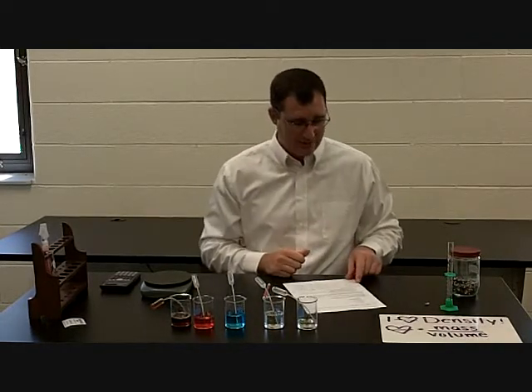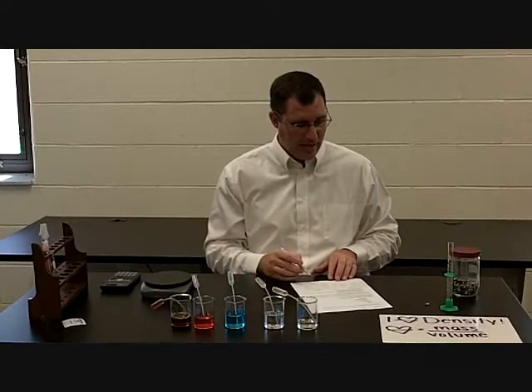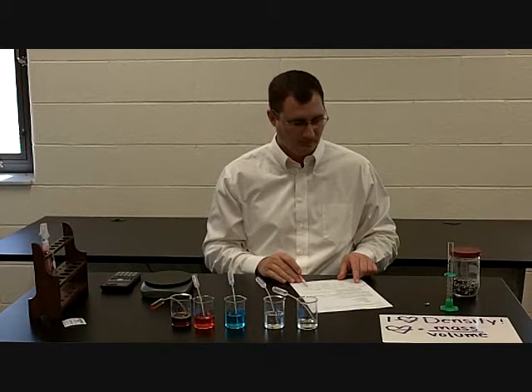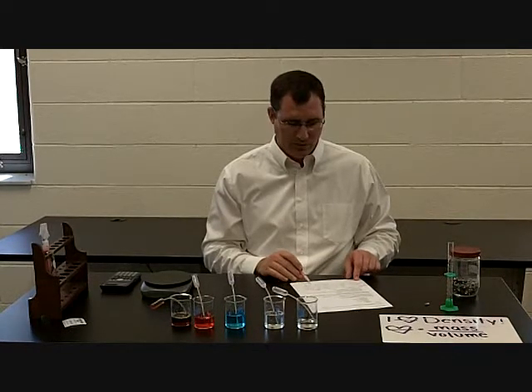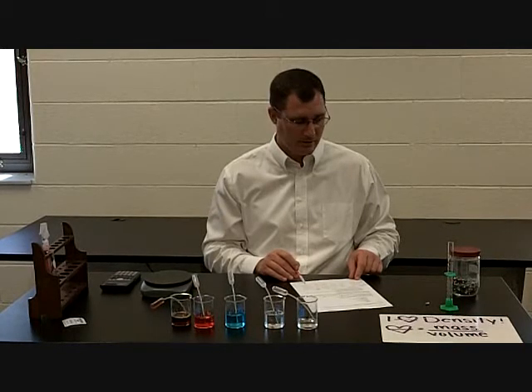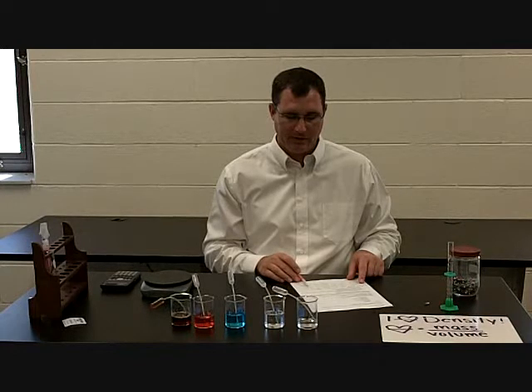So I'm going to look at these and see which one is the most dense. The most dense one I have is the syrup at 1.3 grams per milliliter. The second most dense one I have is the water at 1.0 grams per milliliter. The third is the Windex at 0.98 grams per milliliter.